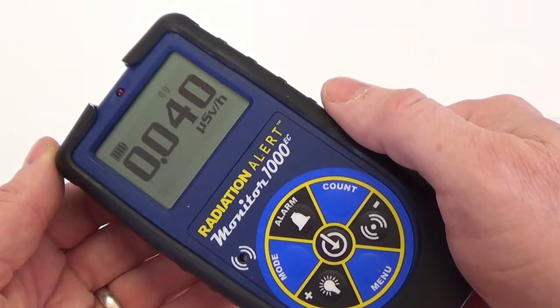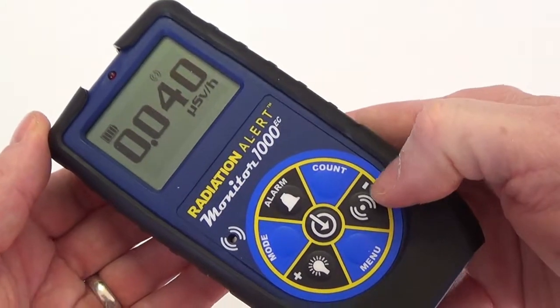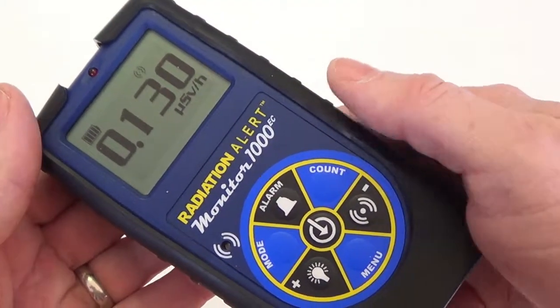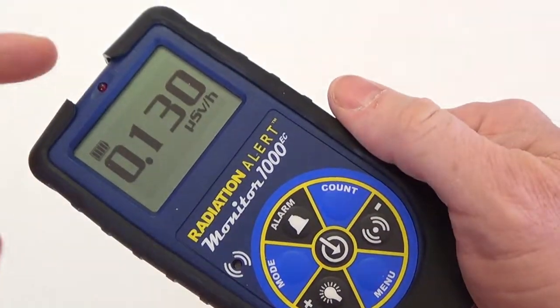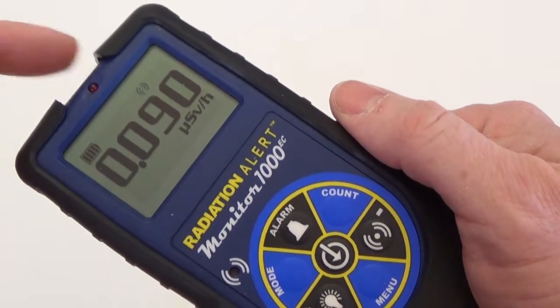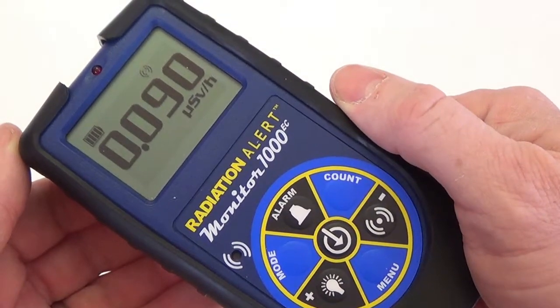You can operate the detector silently by pressing the audio button. Notice the audio icon at the top of the screen. Press the audio button to mute it and the icon disappears. Press it again and the audio is back on and the audio icon reappears.